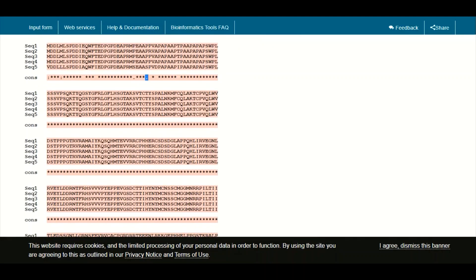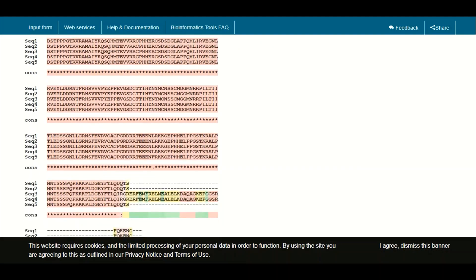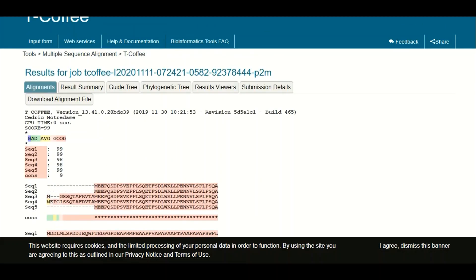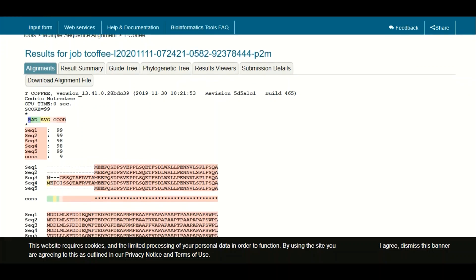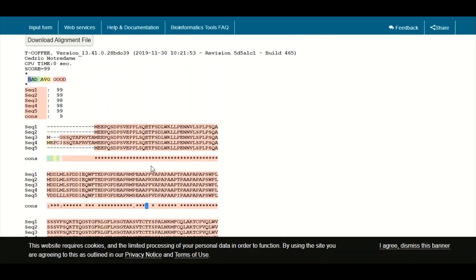This is your multiple sequence alignment giving you an idea about the conservation among the protein sequences. This is an HTML output format. If you use ClustalW or any other output format, you will not have the colors that indicate conservation, which makes it harder to interpret. It is much easier to interpret a multiple sequence alignment in HTML format.